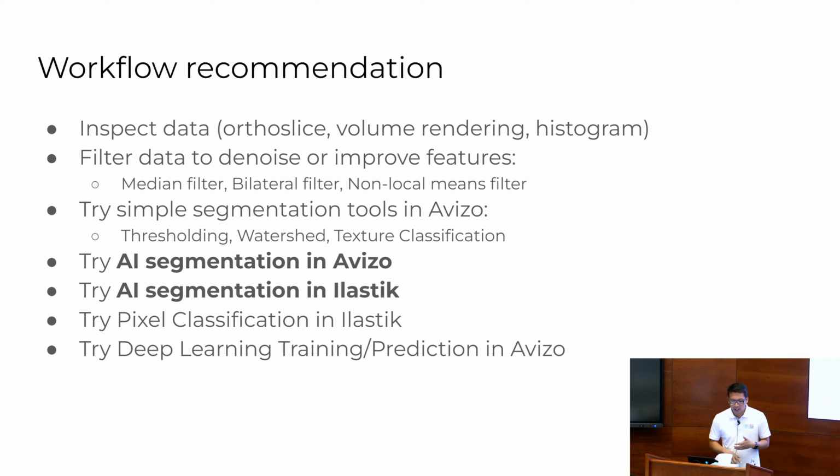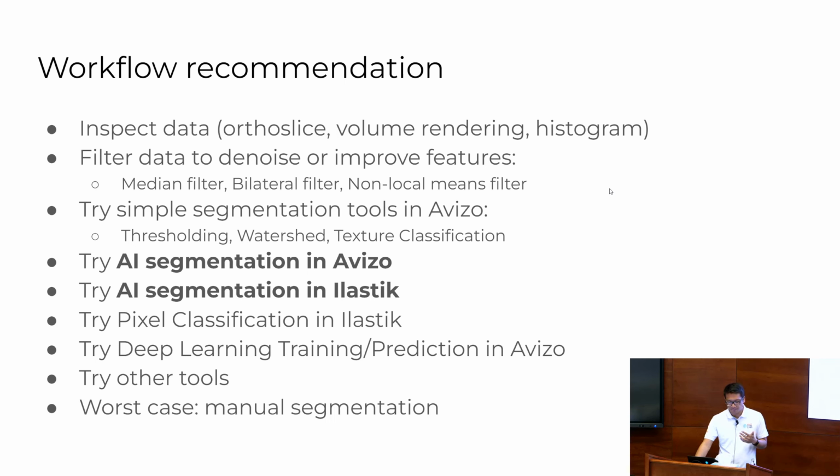So I didn't show it here, but if you're interested in trying it out, let us know or reach out to us. There's other tools out there. I'm going to show some of them in a little bit. Worst case is manual segmentation, right? But this is what you want to avoid.